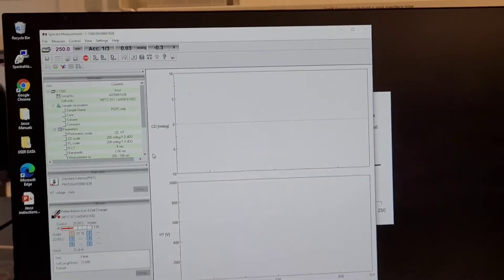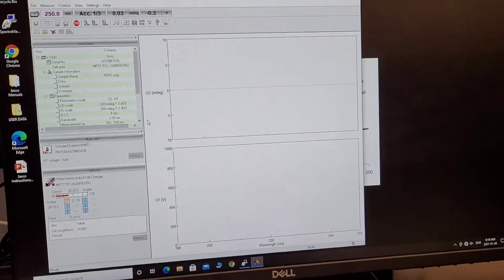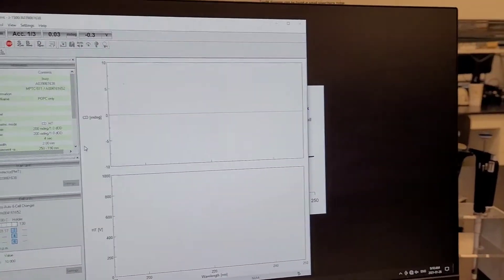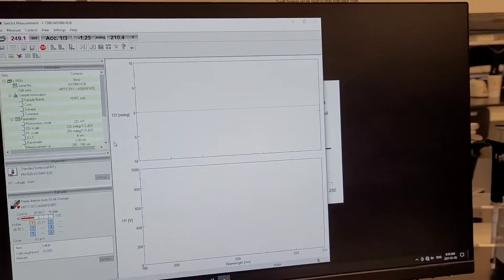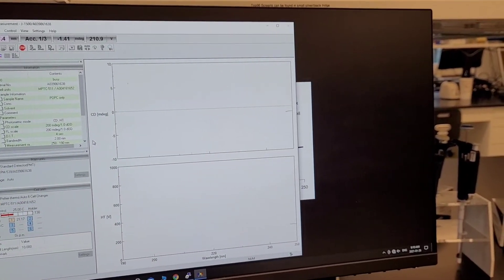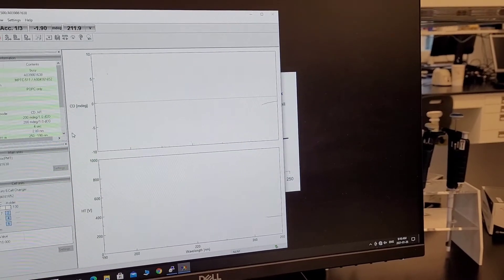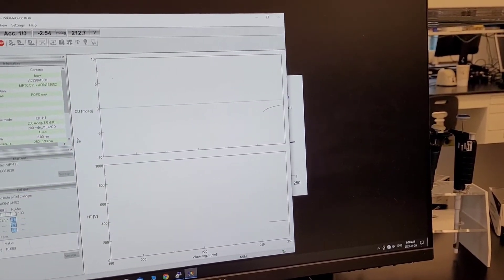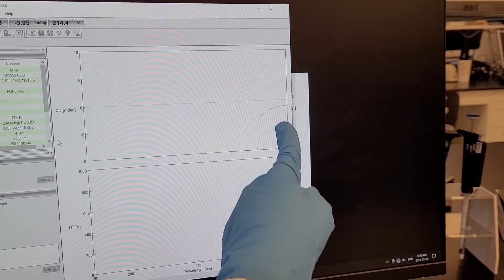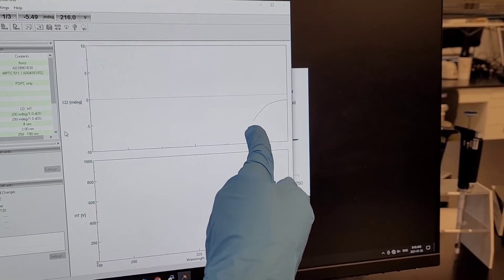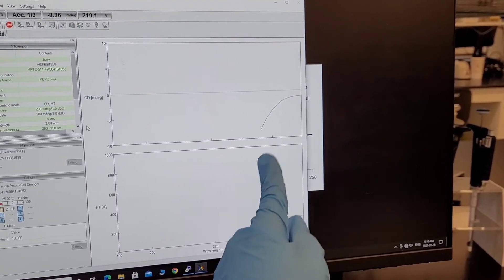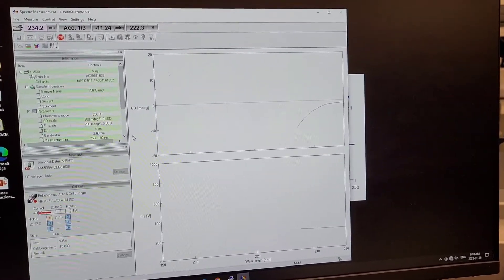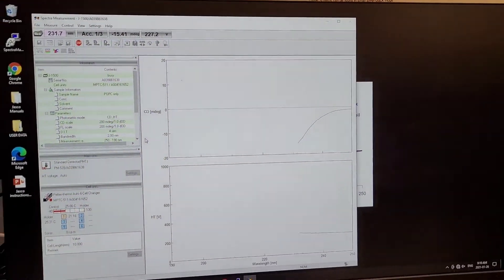This is the moment of truth. See if you have alpha helical, beta sheet or random coil. Today's sample is a protein bound to lipid which forms a nanodisk and I expect alpha helical. Immediately I can see that this is what I'm going to get. I'm going to get an alpha helical shape for my CD. I'm very happy right now.